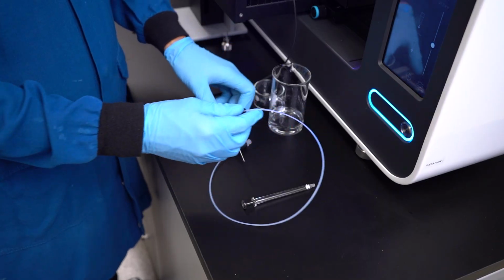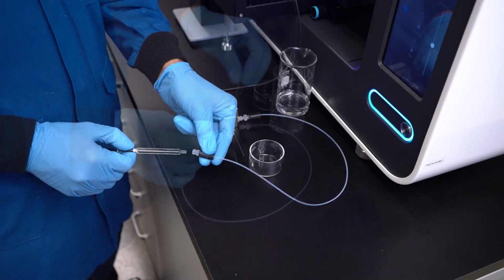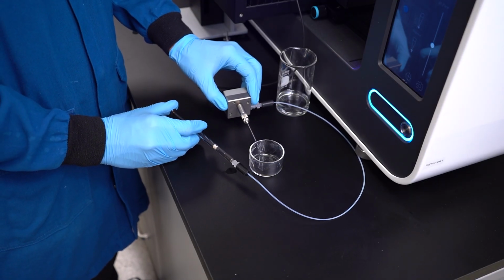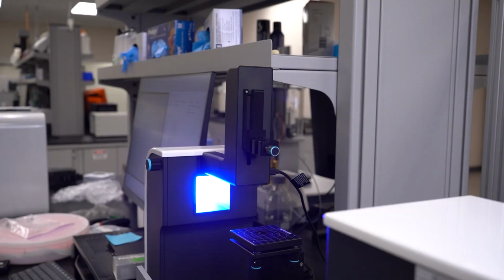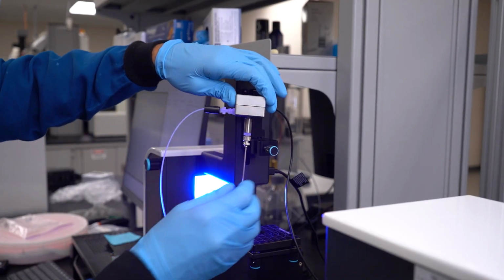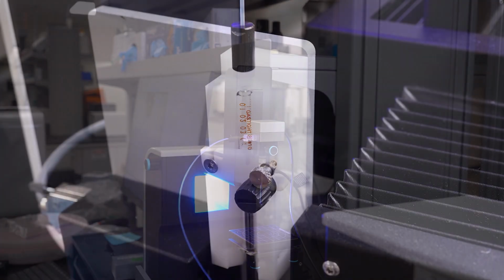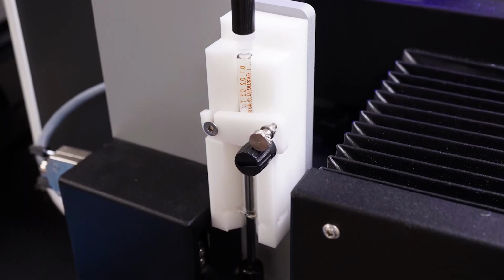For the module to actuate the droplet volume of your desired solution adequately, all air needs to be removed from the system. Draw up pure water into the syringe and push it through until all the air is removed from the module. Connect the module to the dispenser holder and attach the syringe to the syringe holder. Place your solution of interest. Today we are using a surfactant solution.